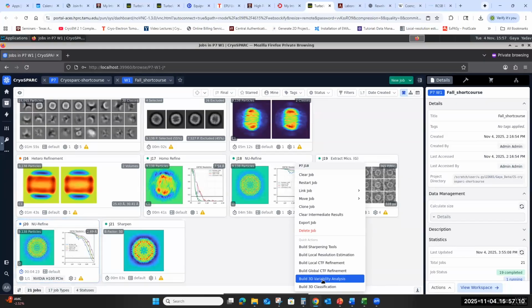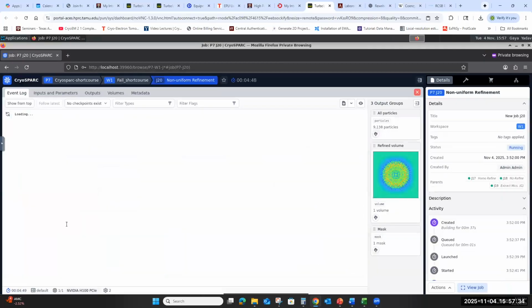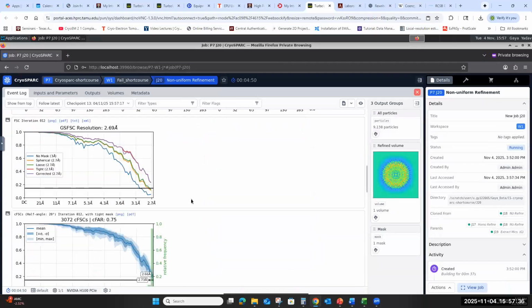This can identify those kinds of changes, and based on that, you can find out the mechanism: when a cofactor, drug or inhibitor binds to a particular site, how other parts are affected by the binding of the molecule. So this is useful for that kind of analysis.